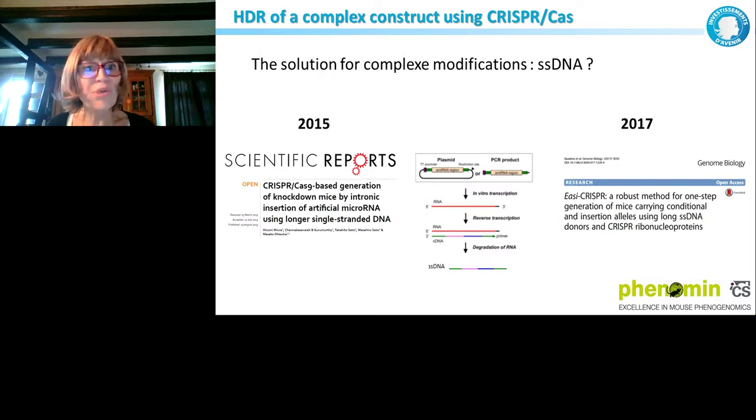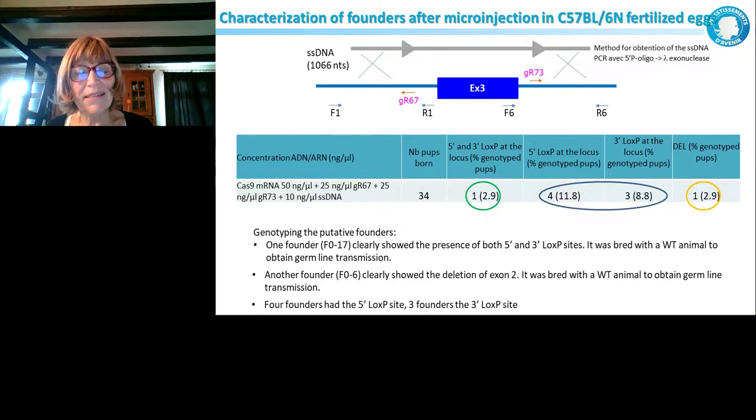And of course, there were these papers in 2015 and 2017 saying that the solution would be single-stranded DNA rather than double-stranded DNA. And there was this paper from Murphy again. And they said that in this case, it will work.